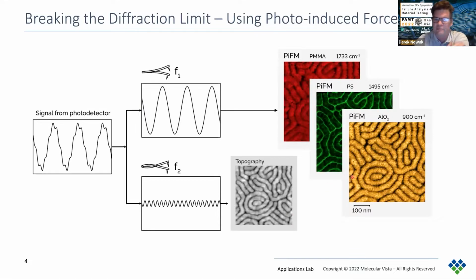So here's the concept of how that's going to play out. We're going to use a multimodal technique, so a bimodal technique. Based on some of the previous talks, if you think about KPFM, EFM, those types of traditional scan probe techniques, think of doing them in a bimodal mode, not a lift mode technique, but an AC bimodal mode.